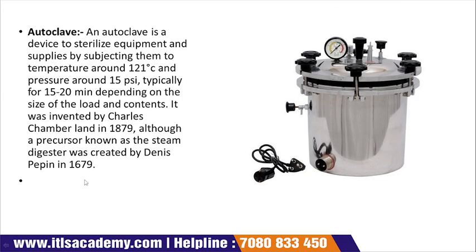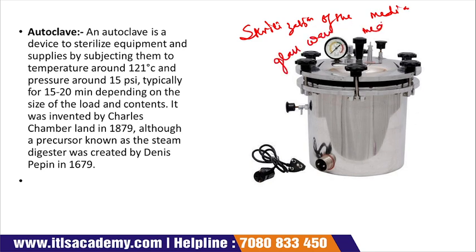The next is your autoclave. As we all know, the autoclave is used for the sterilization of media, glassware, medical instruments, etc. Now, what is the meaning of sterilization?